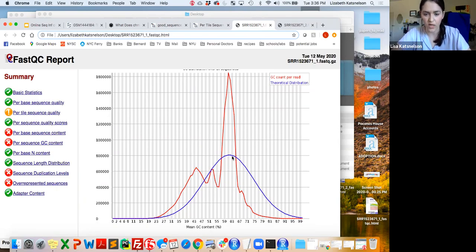I believe the human GC content is a tad lower. Because FastQC doesn't know that this data has viral DNA in it, it's going to give us a flag here. But because we know what we're working with, this shouldn't be that big of a deal. But if you were working with purely human reads, this might be a little concerning.